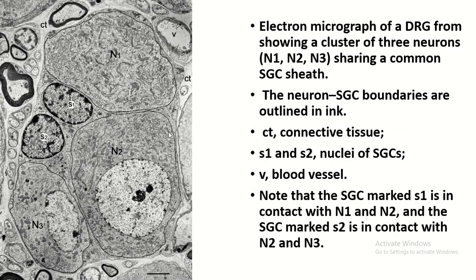This is an electron microscopy picture of the dorsal root ganglia. You see this is the cell body of the sensory neuron with a lightly stained nucleus with prominent nucleolus. This is another cell body of the sensory neuron with its nucleus. Here, another cell body is shown where the nucleus is not present because it was cut in this region. These are the nuclei of two satellite cells — you see the darkly stained nuclei. This is a blood vessel and this is the connective tissue.